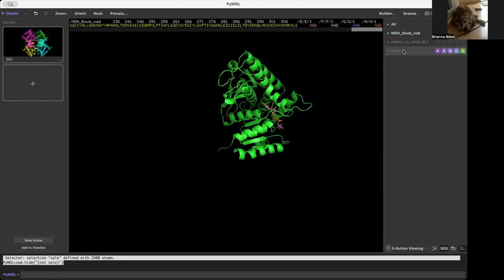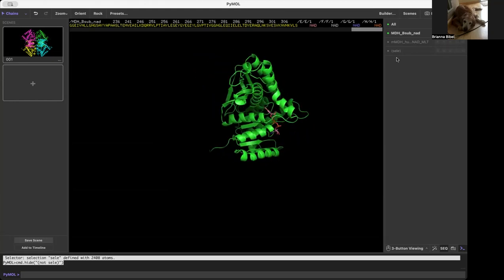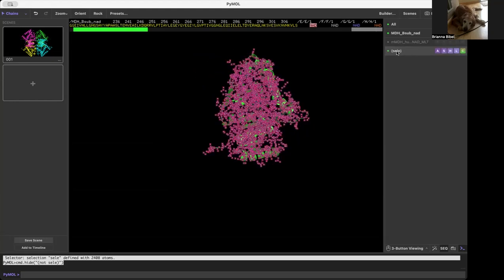Now you have your selection and you can click away from it and you will still have this shown here. And if you were to click back on your selection, it would be the same selection.